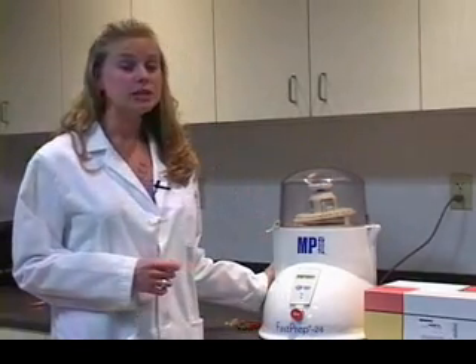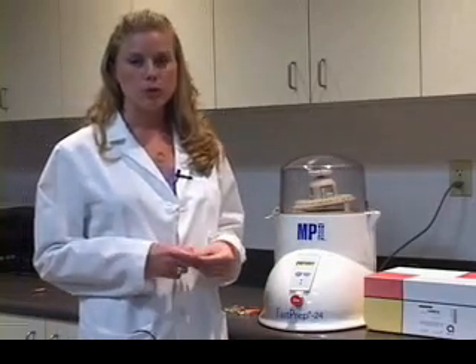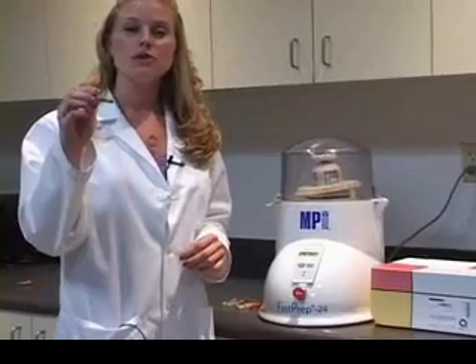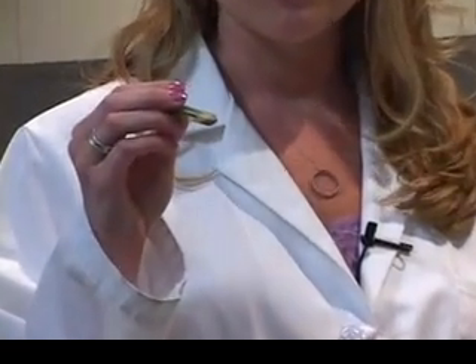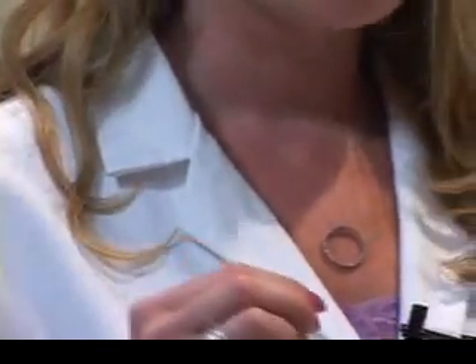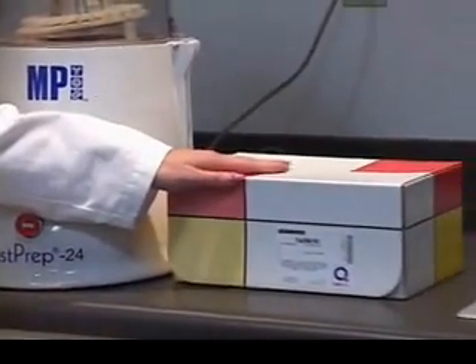The FastPrep system is designed to work best with samples that are very difficult to lyse. There are three parts of the system: the instrument; lysing matrix tubes, which are 2 ml tubes that come with different types of matrix — glass, silica, and ceramic spheres — depending on the type of sample you want to lyse; and the third part is the protein kits, the FastDNA kits, and the RNA kits.